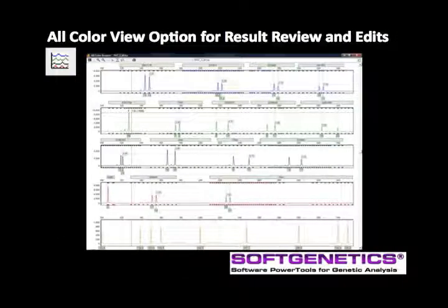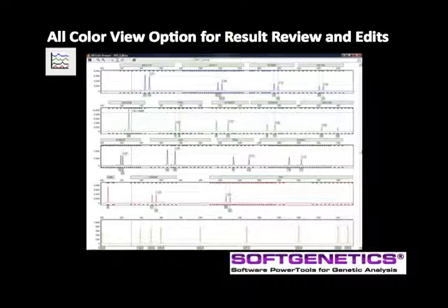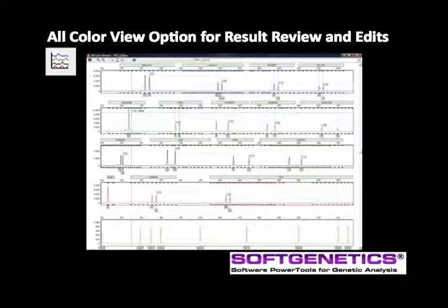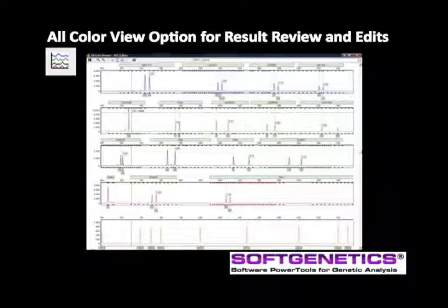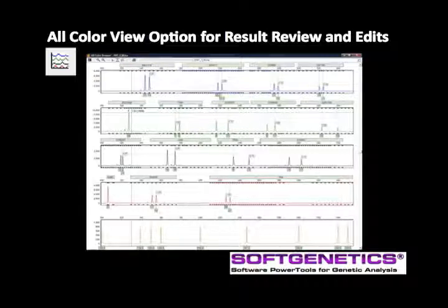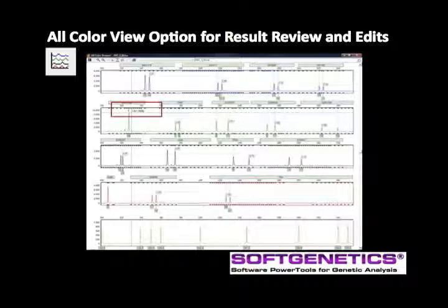Many analysts prefer to review data and make decisions regarding pull-up peaks or peak edits in the all-color browser view, which is activated by the main toolbar icon and has a graph with multiple trace colors. The main analysis screen traces and report table are automatically updated when edits are made in the all-color browser. The crosshairs assist in checking size and height of peaks.